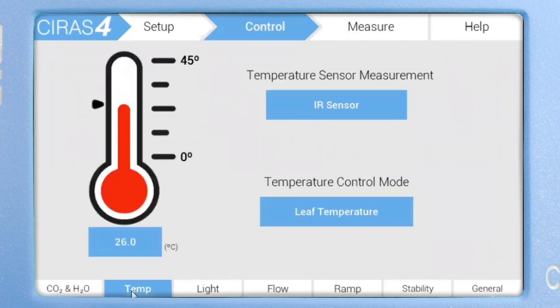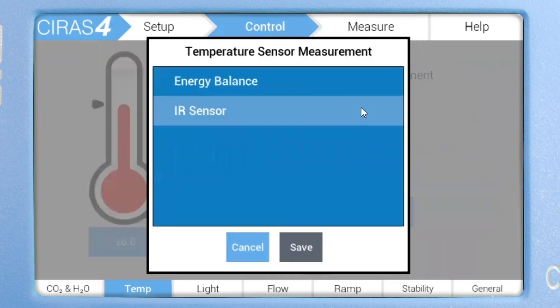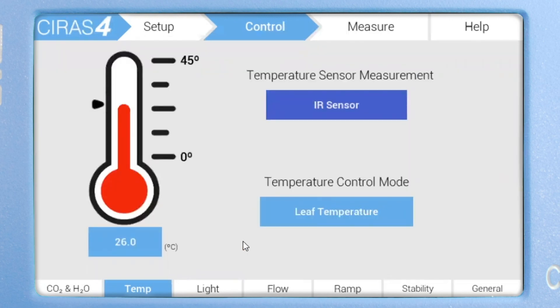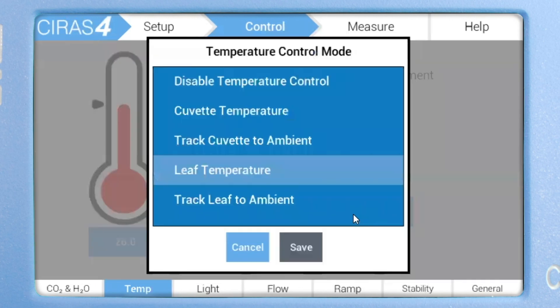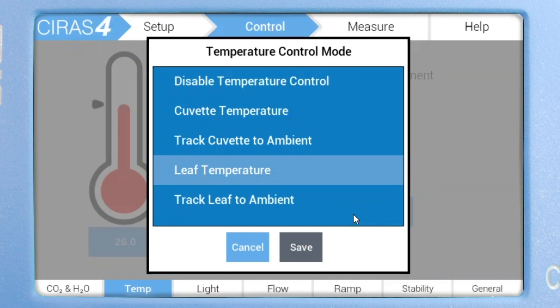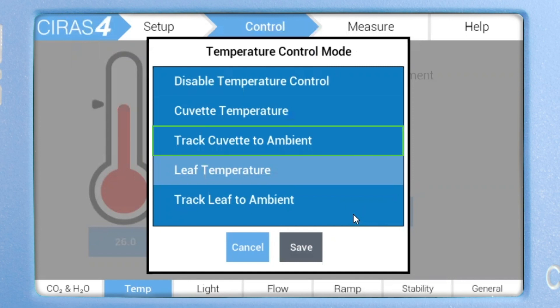Tap on temperature sensor measurement to view the available options for leaf temperature determination. In this case, our two options are energy balance and IR sensor. We're going to leave it set to IR sensor. Tap temperature control mode to view all available temperature control options, which include disabling temperature control completely, controlling on cuvette temperature, tracking cuvette temperature to ambient temperature, controlling to a specific leaf temperature, or tracking leaf temperature to ambient.